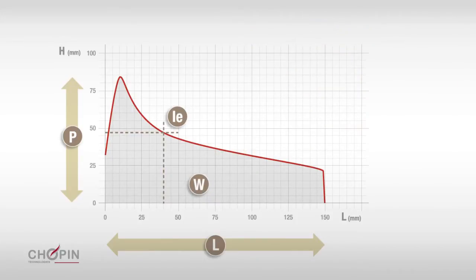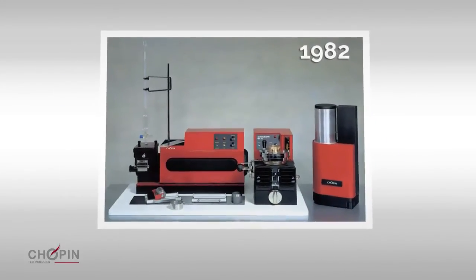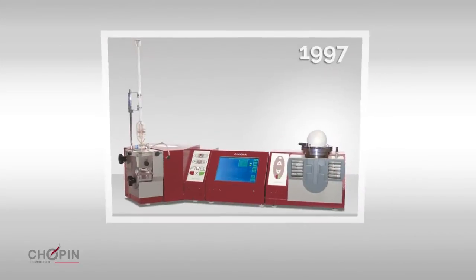The alveograph, invented in 1920 by Marcel Chopin, became an industry standard tool during the 1970s and has been subject to constant development and evolution.